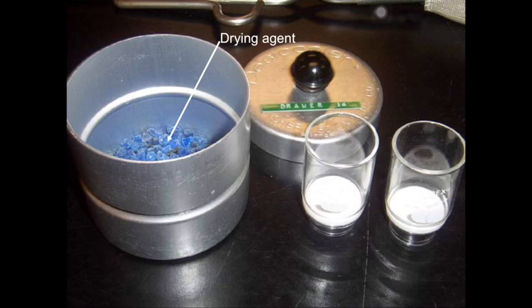If they are blue, it means they are dry, but when they change color to pink or red, it means they are very wet. So your crucibles are placed inside your desi-cooler or desiccator in order to keep them dry.